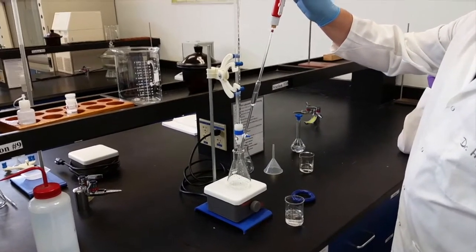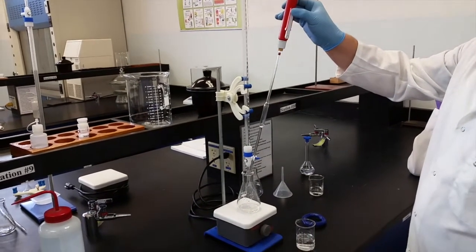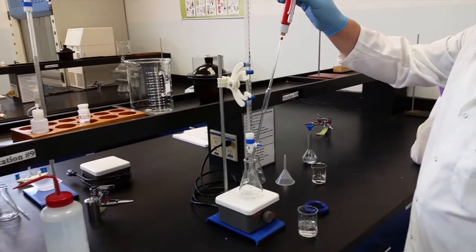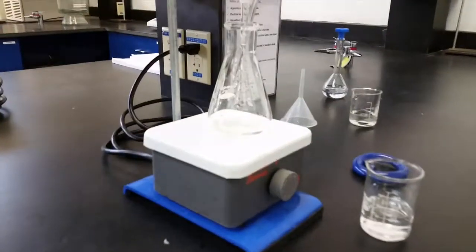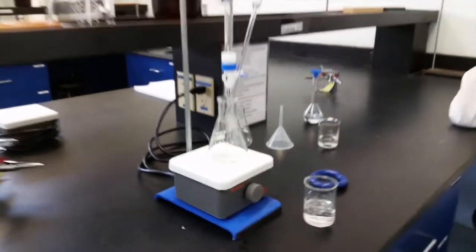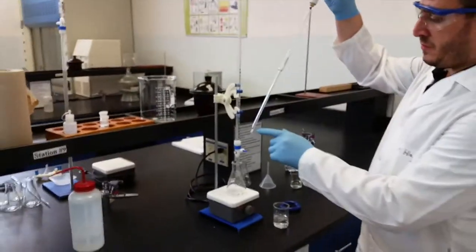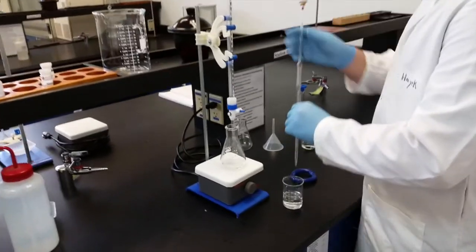You will not force the solution to get out of your pipette, because some of the solution will stay inside the pipette, and this is accounted for. If you force it, it means you added more than 10. So what remains here in the pipette is accounted for. Just leave it in the pipette.